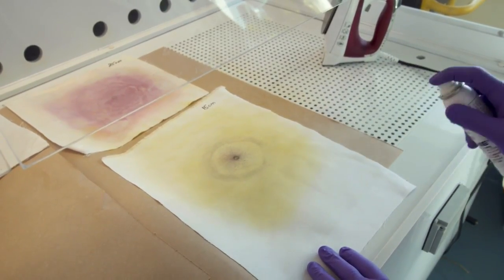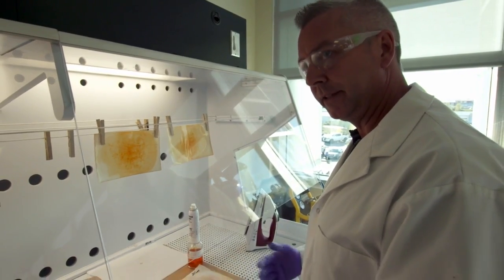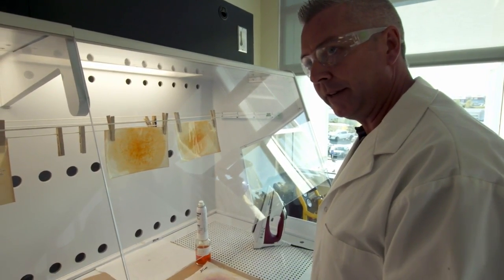Even through dark, bloody clothing containing a gunshot, we can pick up these types of residues and it helps us determine the distance the shot was fired.